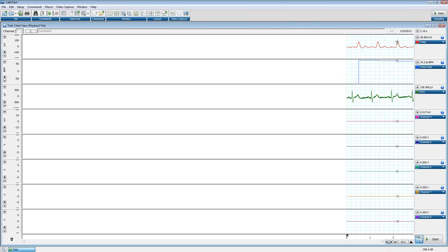If you're talking about a sound, there's actually a feature that will do this without a macro. That feature is called audio output. And I don't think I have it set up here, but you can use audio output to do that. Audio output should give you the ability to change a sound that you're playing out based on what you're seeing in a channel. Now, that being said, if you wanted to do it based on something you're sending out in terms of a stimulator, you could do that as well with a macro.